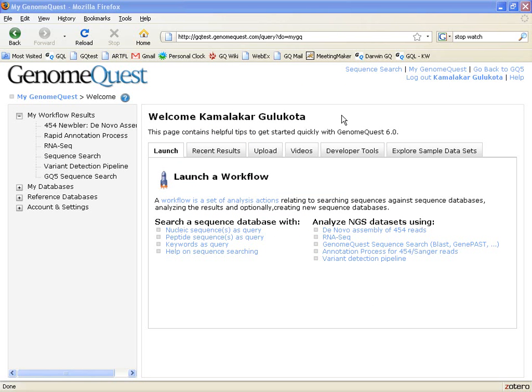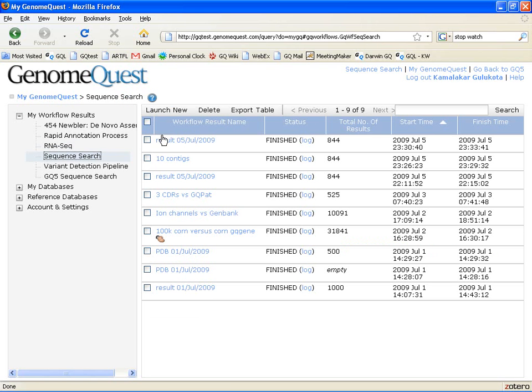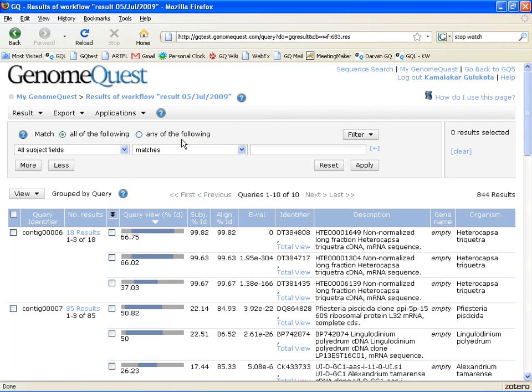All your sequence search results are available from the My GenomeQuest page under the Sequence Search link. When you click on the name of your result, the results get opened in GenomeQuest. The results page shows that all 10 of my queries have hits and there are a total of 844 results.